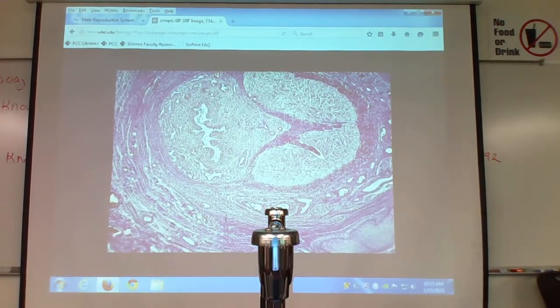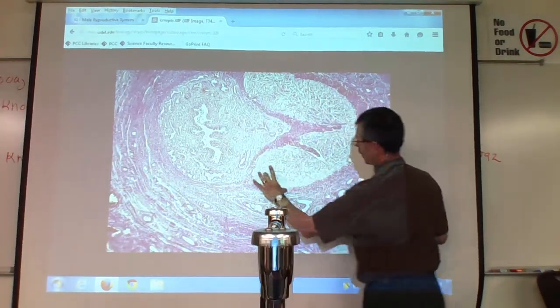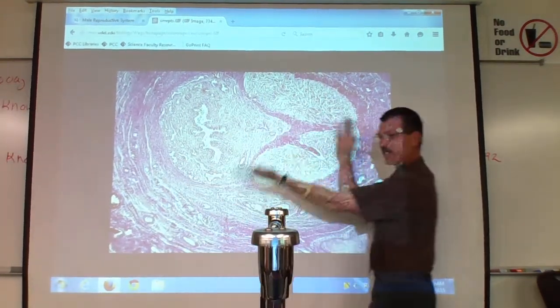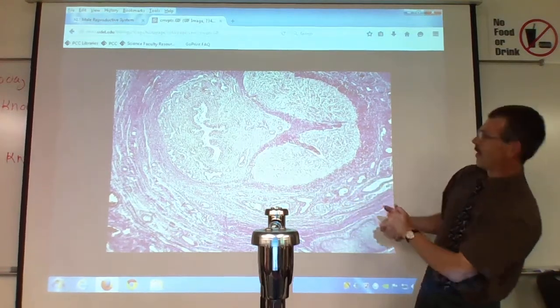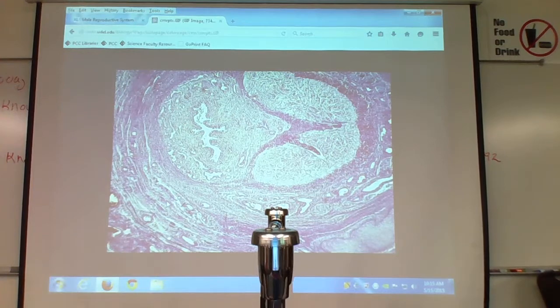And that's a typical penis slide. So two eyes, and then here's the mouth. So he's on his side. It's like this. Yes. Okay. Right? So let's go through penis parts.